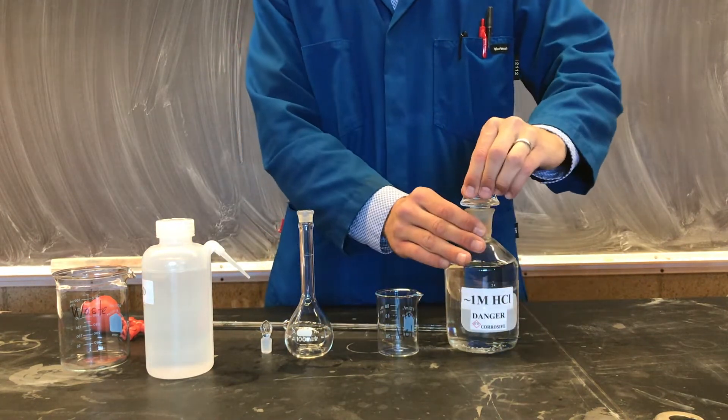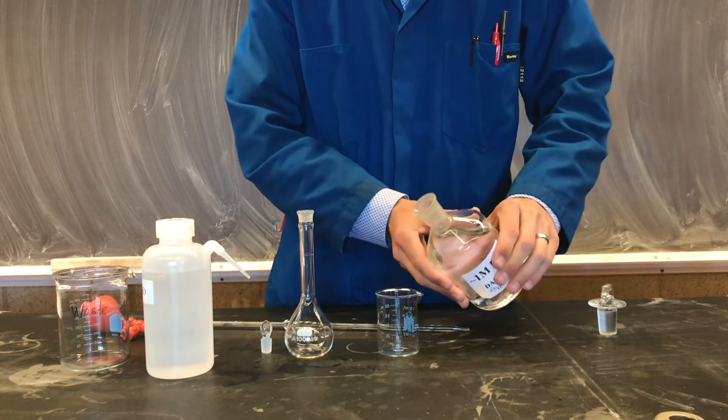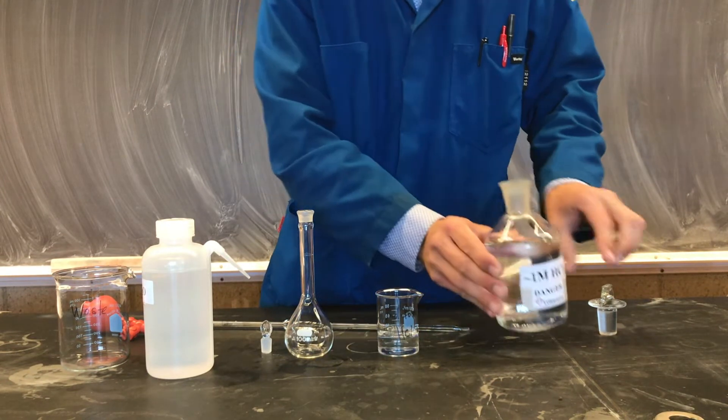We'll begin today by diluting our hydrochloric acid solution. This solution is approximately one molar, but a titration will be used to determine the exact concentration.